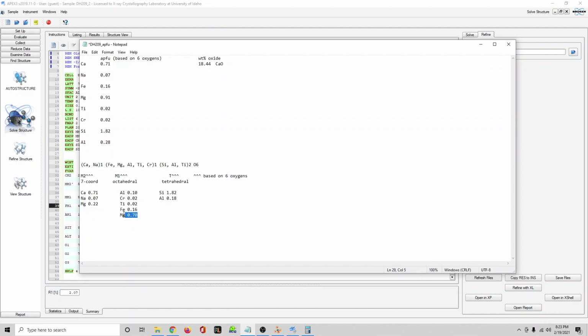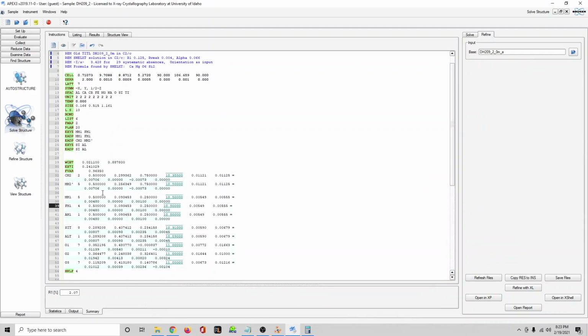The only inaccuracy in this is that I added 0.01 Mg to the site, because otherwise this would have been 0.69 and it wouldn't have summed to 1, which M1 is supposed to total. The tetrahedral site has to total 2, and it does. So that is all good. And everything else is fine. So I'm going to try to make that happen and not mess up too much, even though I think I have to think about the M2 and M2 prime still.